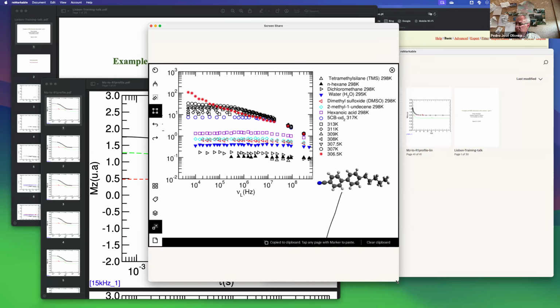And the thing I want to show you, okay, so let's forget about it. The thing that I want to show you is that by changing the phase, the profile changes. You see, it's obvious, I think, for you. The red stars completely change the shape, the way the profile looks.